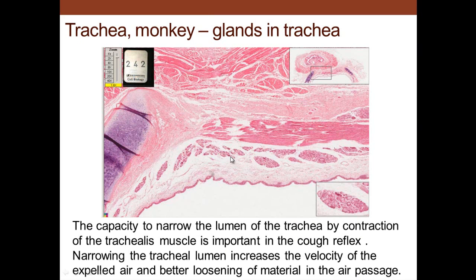And here we see, in the monkey, this is a smooth muscle there. There's glands. We're talking about the trachea here, not the esophagus. This is part of the esophagus here. Hyaline cartilage, perichondrium. This is lamina propria, and maybe you might call this submucosa by that point, but there are glands that are located in through there.